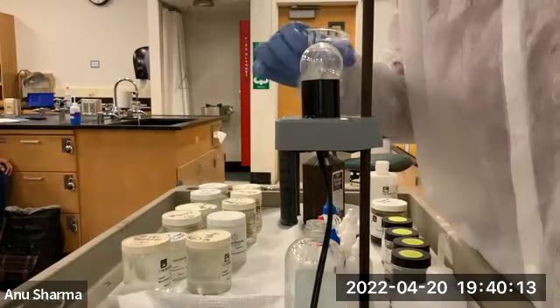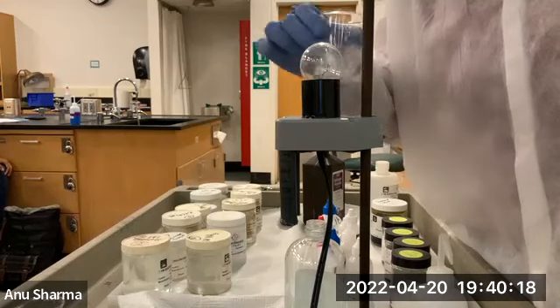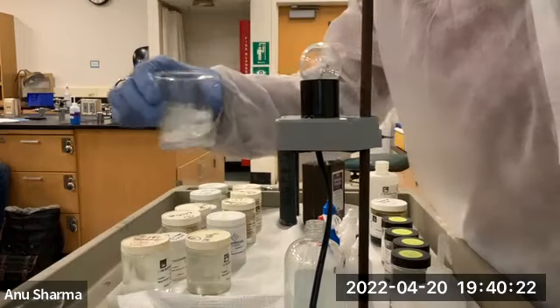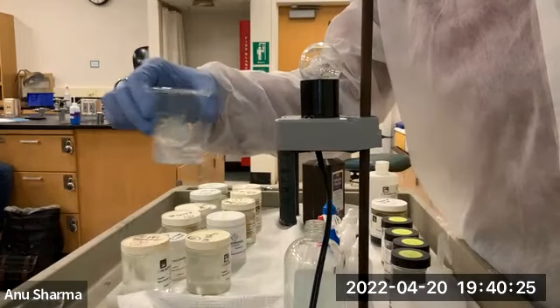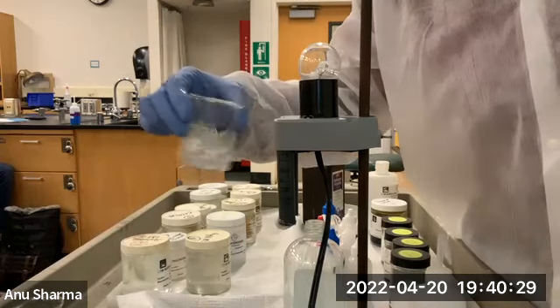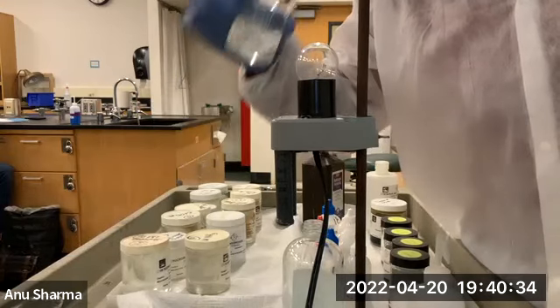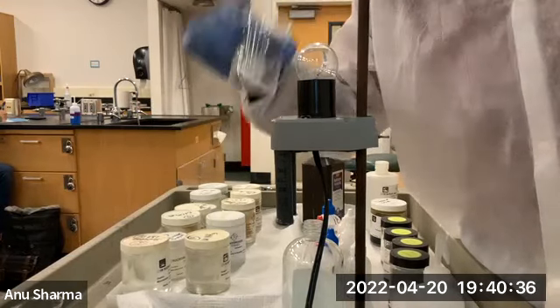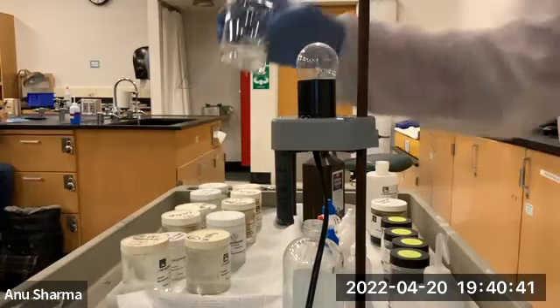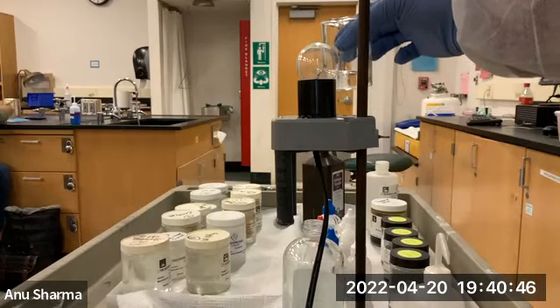Remember that you're disturbing the electron clouds, or the molecular clouds, in water. Majority of it is dissolved, a little bit is still left. So it's not like immediately it dissolves. You have to shake it, and if I heat it, it will dissolve. Most of it is gone. So you can say that it is soluble in water, because anyways, it has sodium.